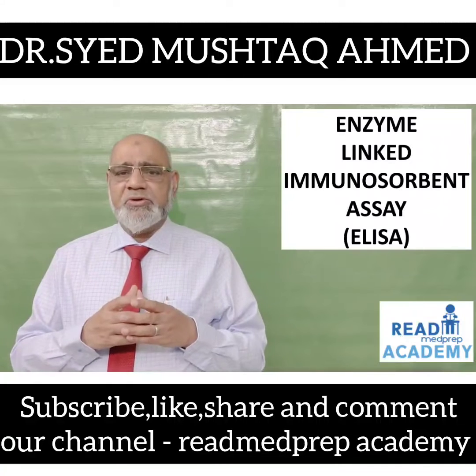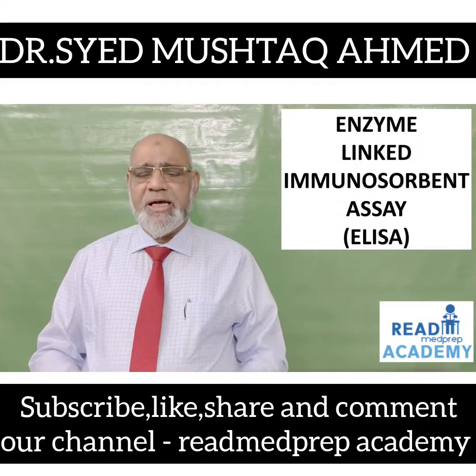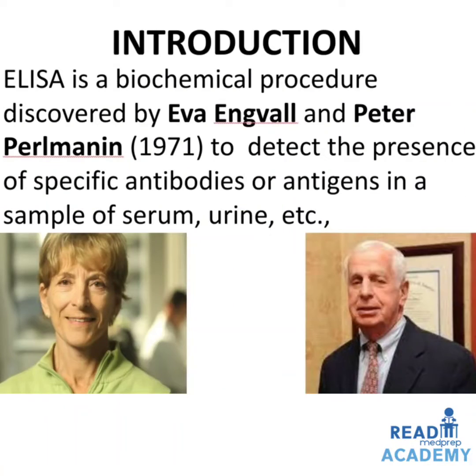Now let us move on to the enzyme-linked immunosorbent assay, ELISA. ELISA is a biochemical procedure discovered by Eva Engvall and Peter Perlmann in 1971 to detect the presence of specific antibodies or antigens in a sample of the serum, urine, etc. Their images are given below.